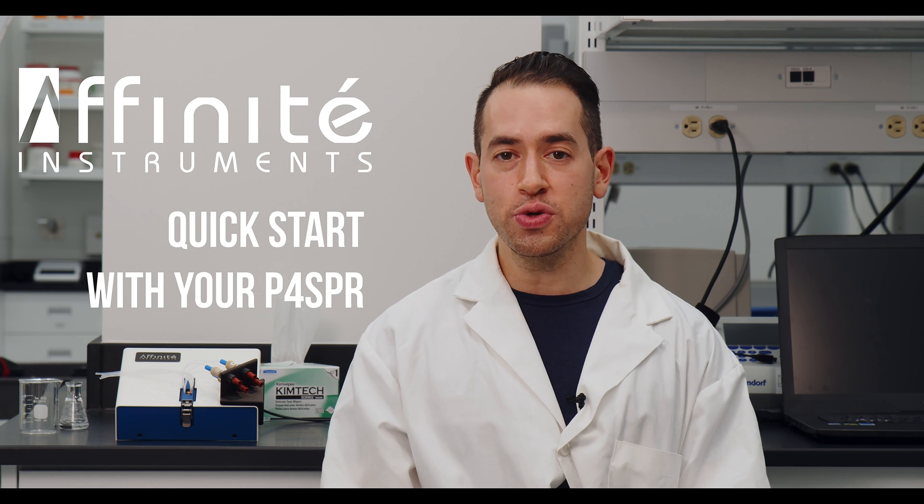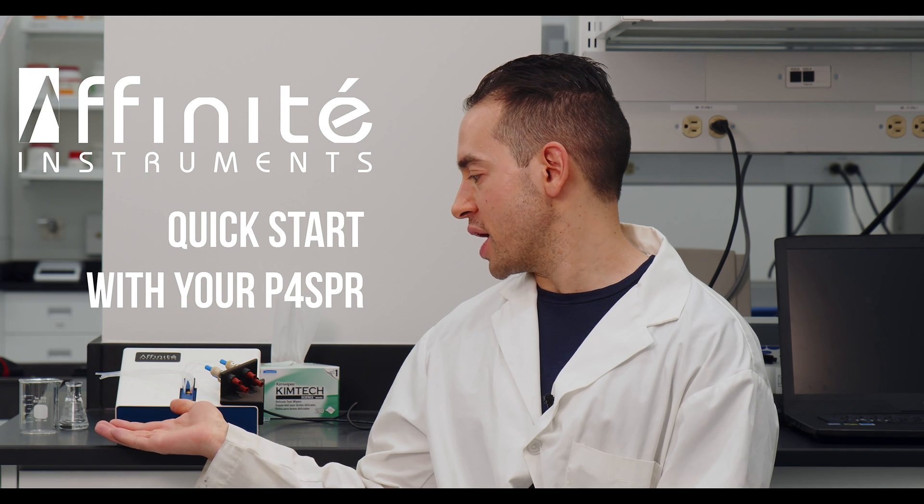Hello, my name is Cory. I'm an asset development scientist at Affinite Instruments, and today I'll be walking you through proper use of the P4SPR.